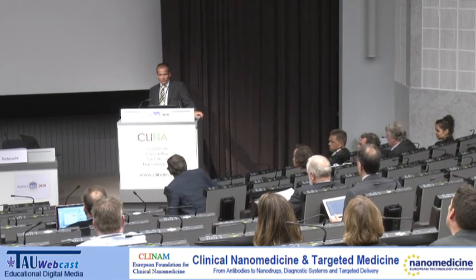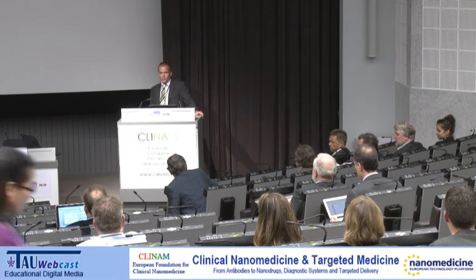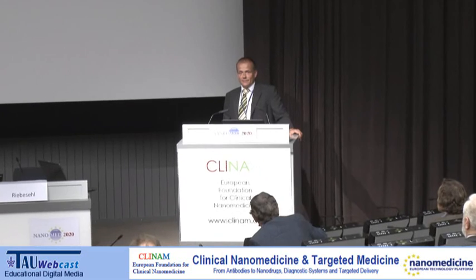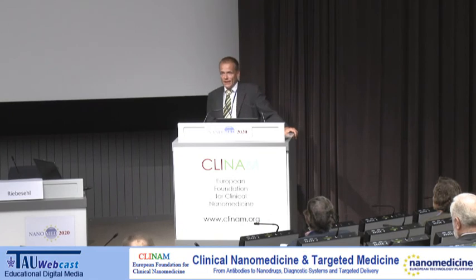In case of the nano suspension, of course it's then only applicable for drugs in which, let's say, in the whole absorption process, dissolution is the rate limiting factor. Right. That's true? Or does it have additional advantages? No, in principle you're right. That's the main effect. But very often we have a combination.